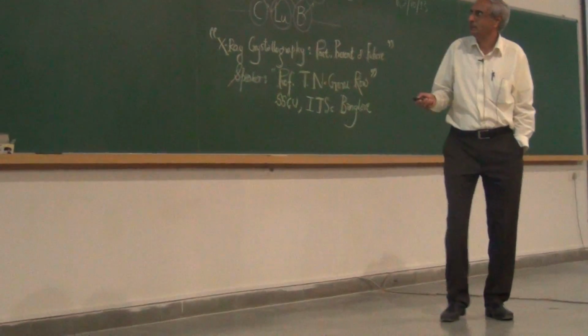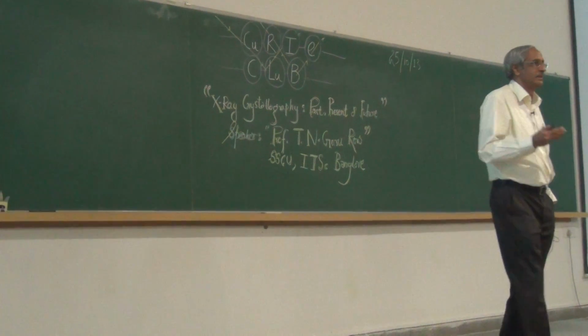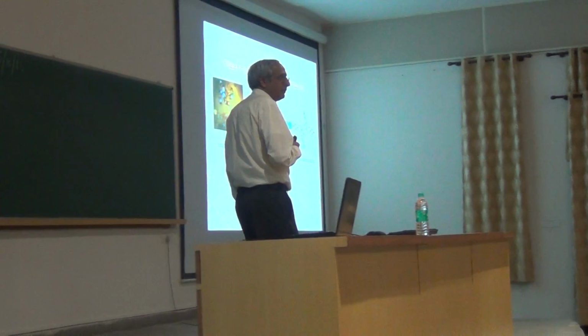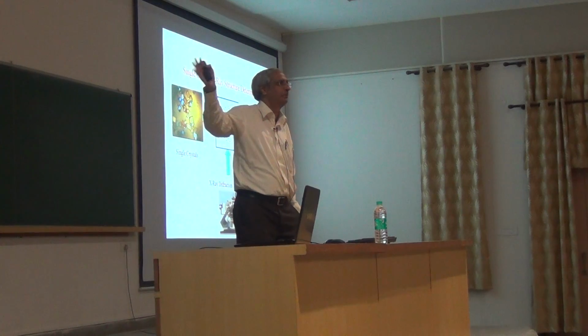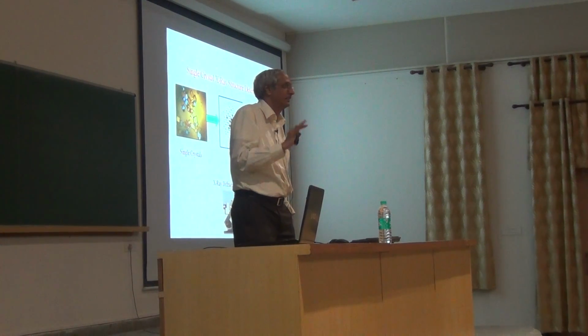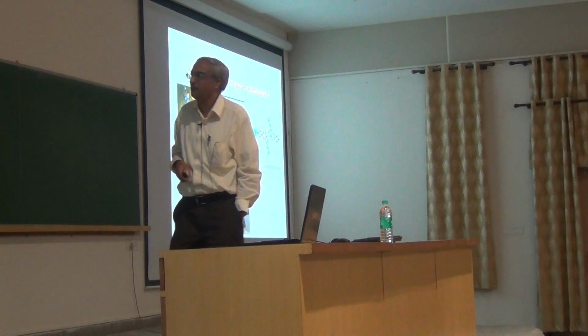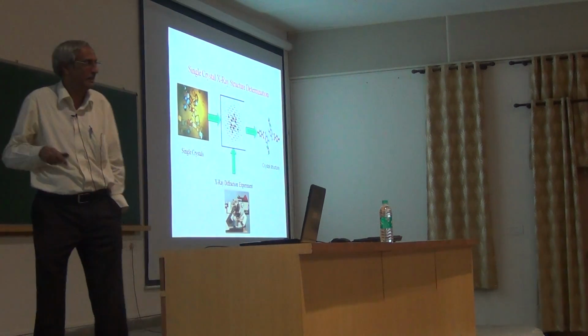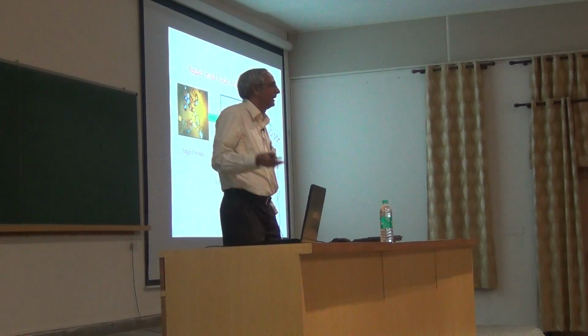We can also look at situations where we can have intermolecular interactions differently. The same molecule having different intermolecular interactions, giving rise to the phenomenon of polymorphism, which has now become part and parcel of any drug design and drug activity. So there are a large number of drug industries which queue up to find out whether a given material can be made into a polymorph. I think Anshu has done some work recently on generating polymorphs.